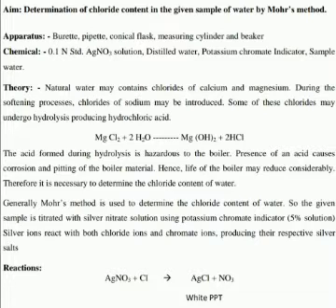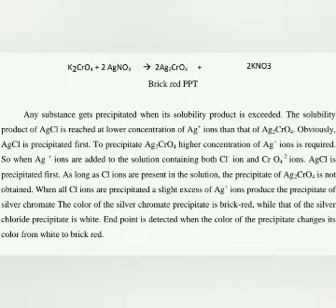In this process silver nitrate is used as a titrating solution. Initially it reacts with chloride and forms silver chloride. So as soon as the titration goes on, all the chloride ions react with this silver nitrate and get converted into silver chloride, which is a white colored precipitate.